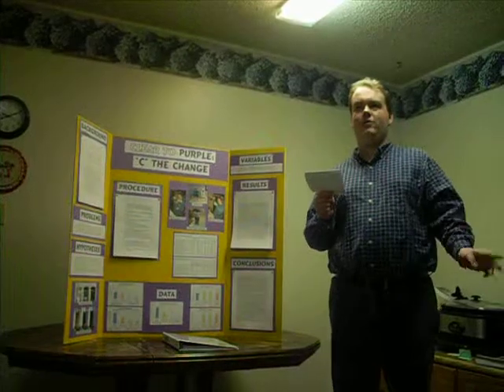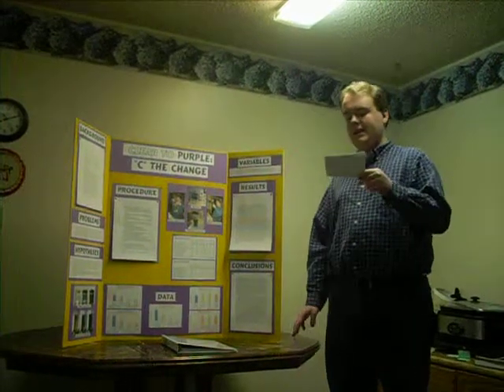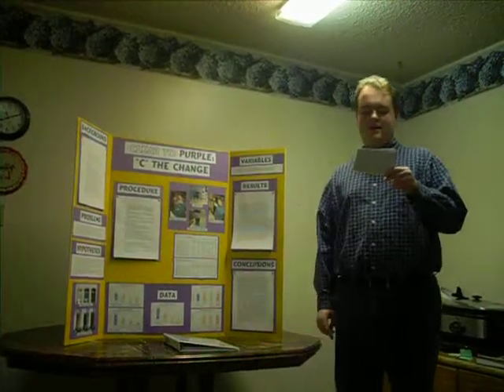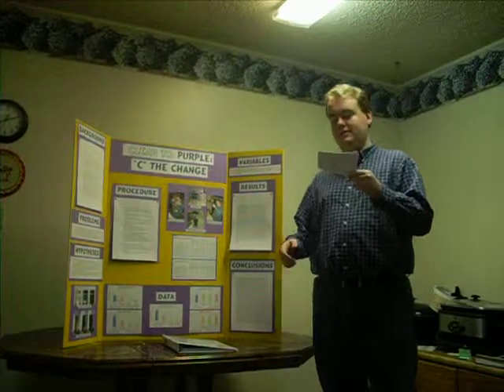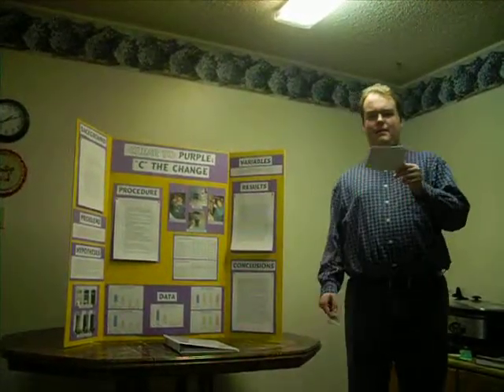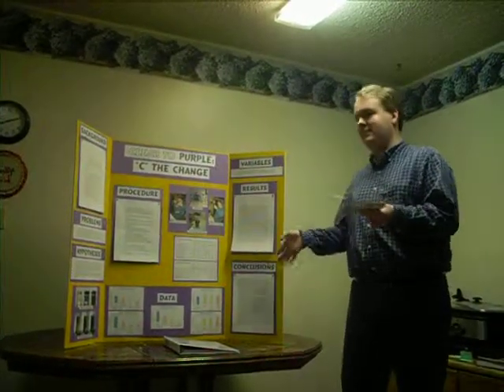I did 3 repetitions for each category in the subgroups. For the Briggs-Rauscher reaction, my variables were the heat and the hydrogen peroxide, and the constants were the equipment, other ingredients, time, number of stirs, and basically the same as last time. The control groups were the base groups and the zero groups. And there were 3 repetitions for each group, though it totals up to much less because I didn't have as much I was testing.